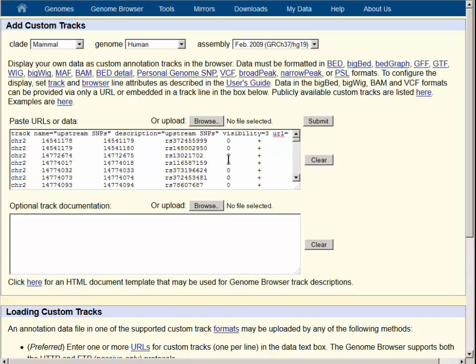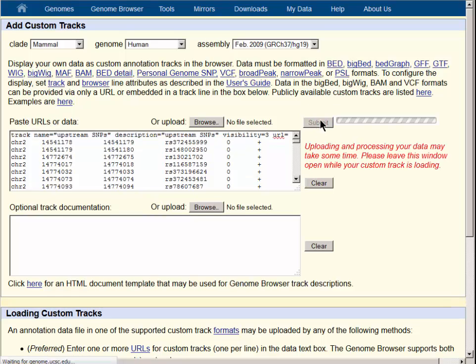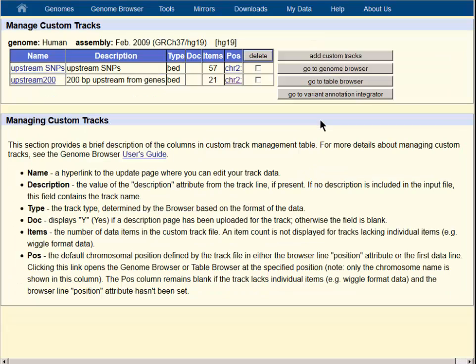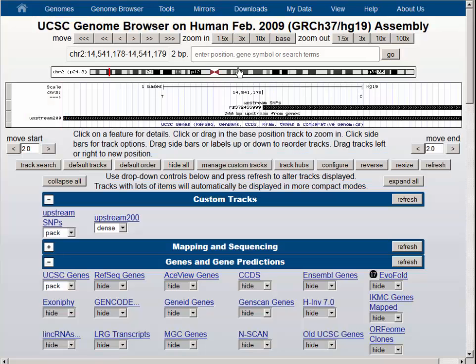Once again, we'll zoom up to the top and we see that the information we input earlier is available to us as a track header. Submitting at this page takes us back to the manage custom tracks page and now we will click on the first of the upstream SNPs and it will take us to the browser graphic.